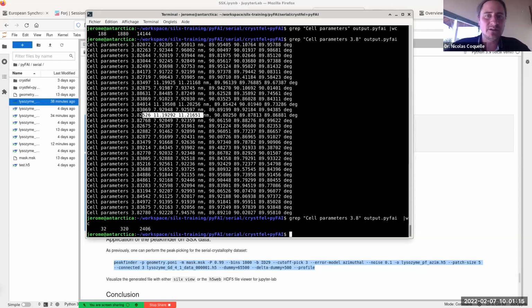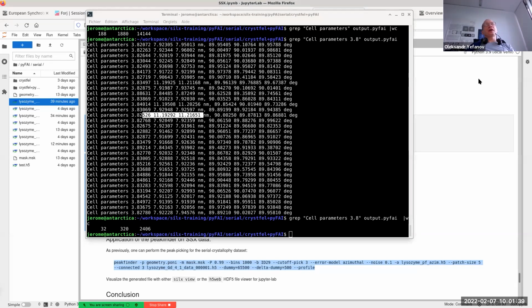We know it's possible, but the proper way to implement it is something we are looking into. But you're right about resources. What we used was the Maxwell cluster, where we have up to 100 machines, 80 cores each. You don't need that much, but you really need a lot of computing resources. You're completely right. If you don't have those resources, it doesn't really work. Okay. Thanks.